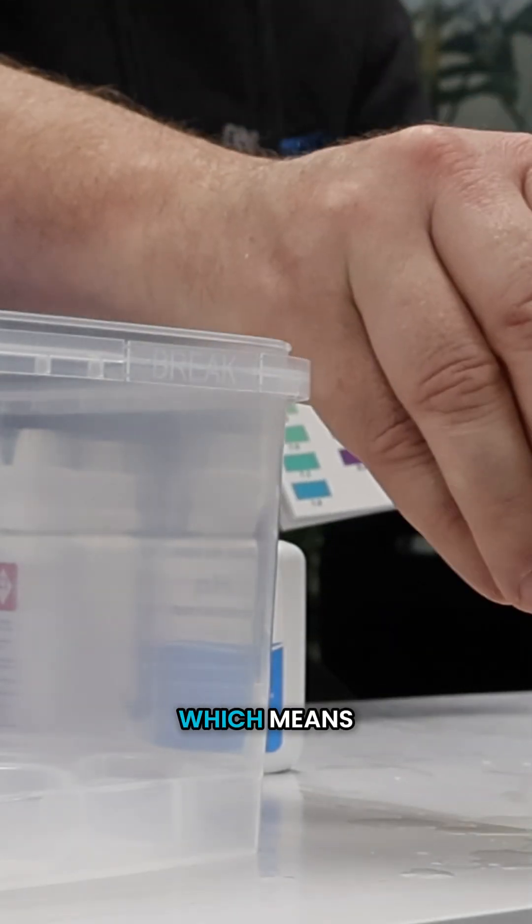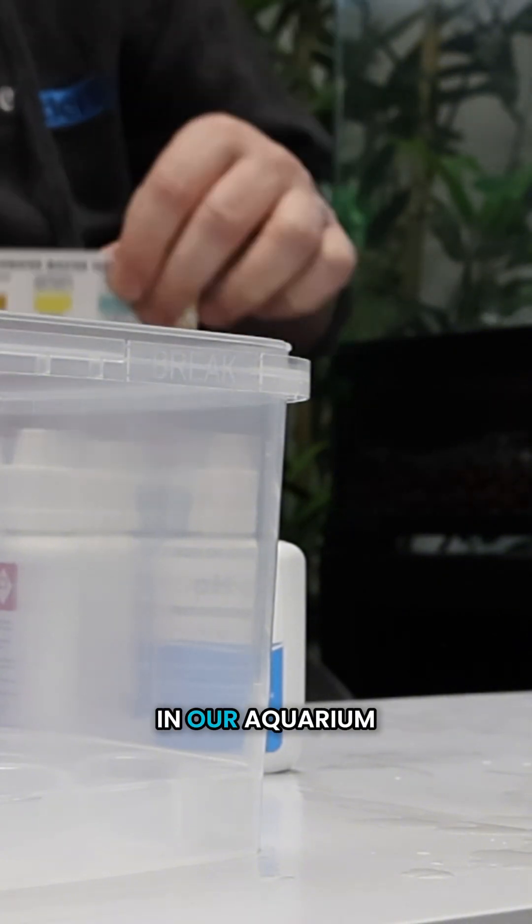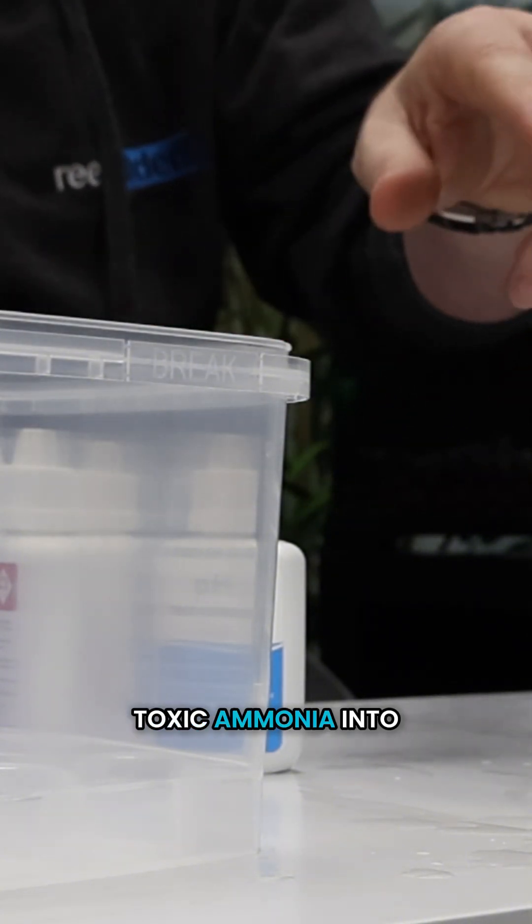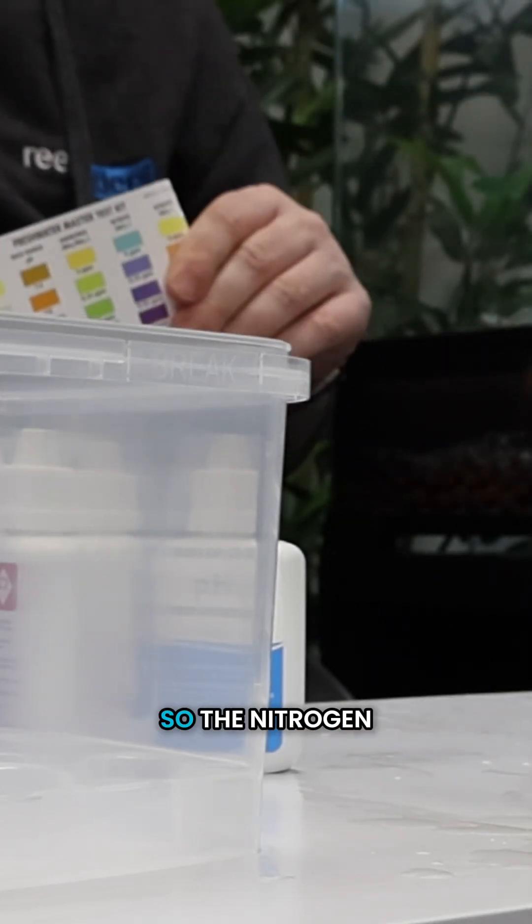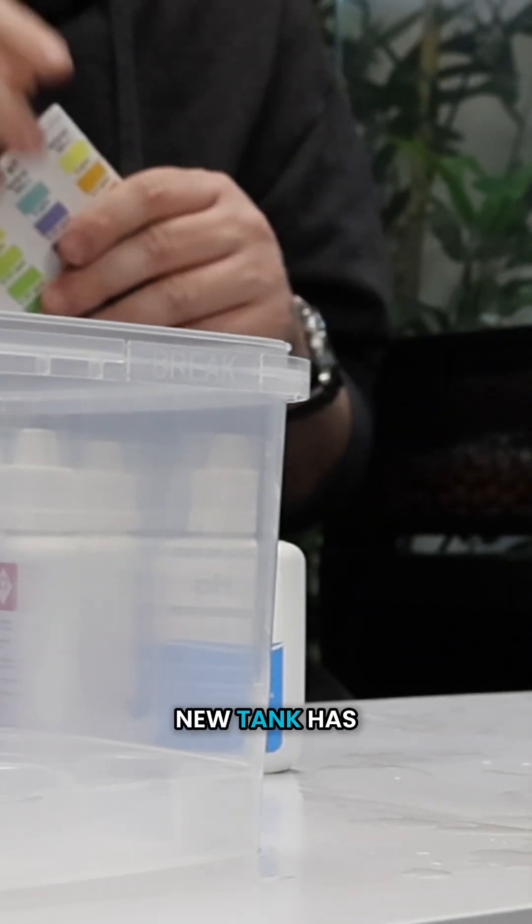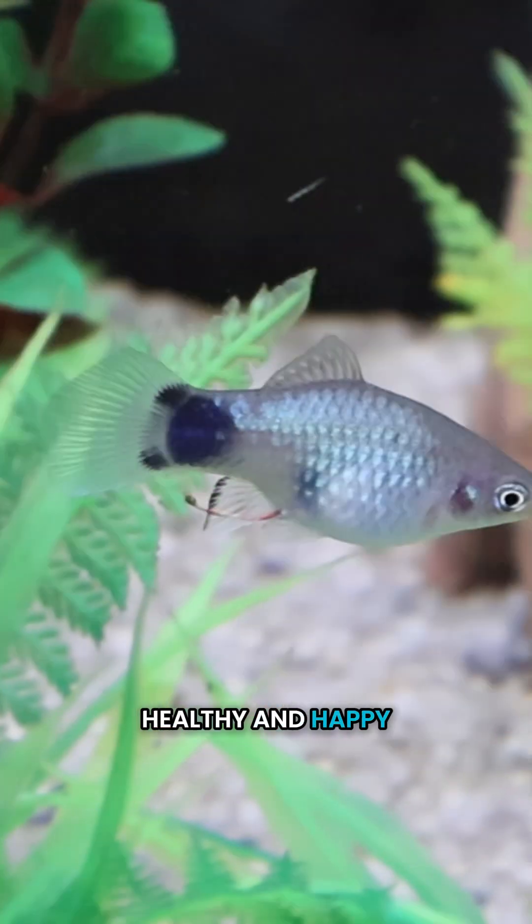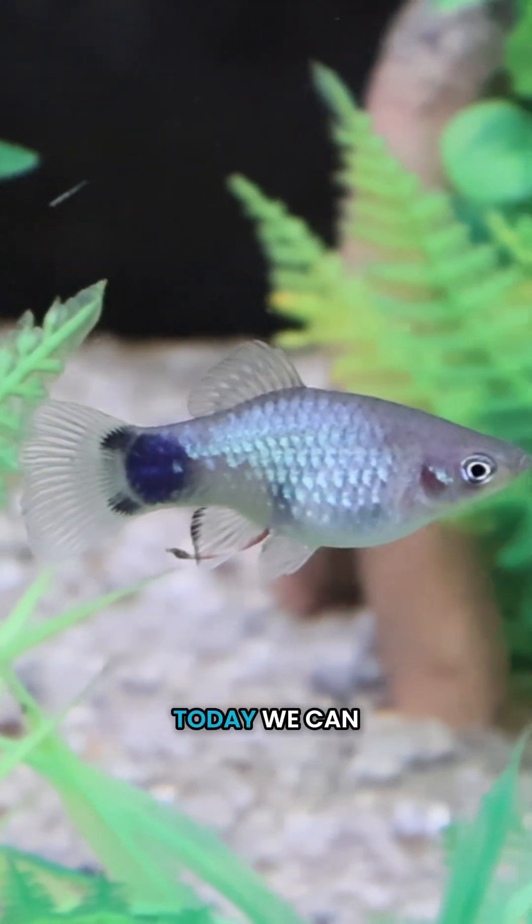Which means there's sufficient bacteria in our aquarium to convert toxic ammonia into nitrite and then into less harmful nitrate. So the nitrogen cycle in our new tank has begun. Our fish are healthy and happy, and if you want to add six more fish today, we can do.